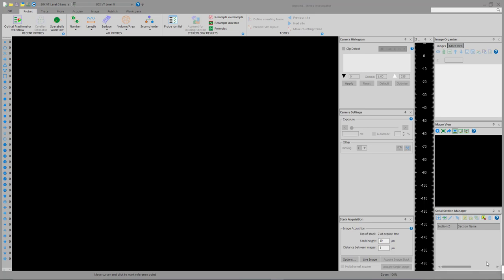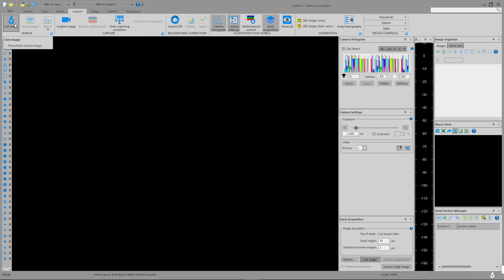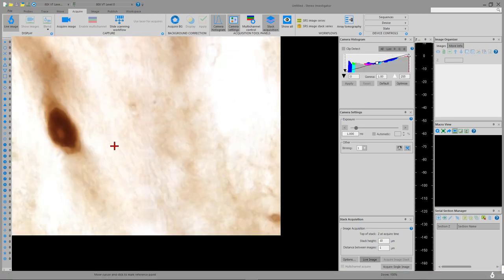Now that we have the light path set in the microscope, what should we check in the software? In the software, click on the Acquire tab. The first thing is to make sure the camera is communicating with the software by clicking on the Live Image button. In this case, that was all we needed — just turning the live image on. You'll also want to check the Camera Settings window: make sure you have a reasonable exposure time — for bright field work, less than 100 milliseconds — and make sure your camera histogram is set correctly. For bright field work, you almost always want the default settings using the Full Histogram window.